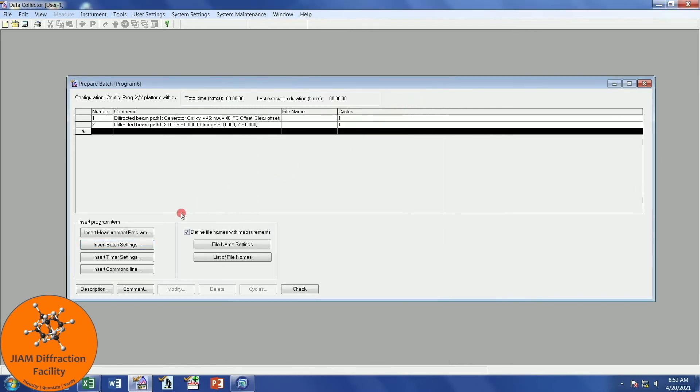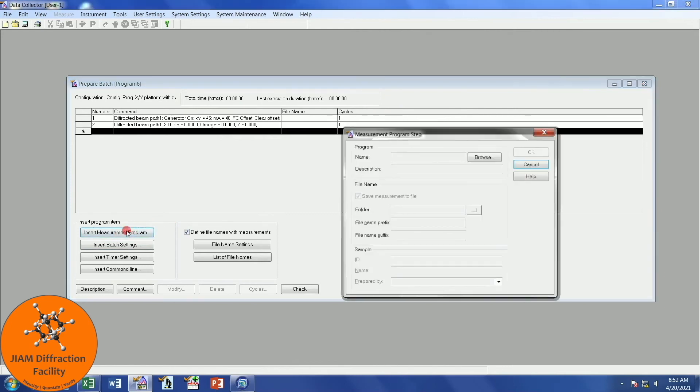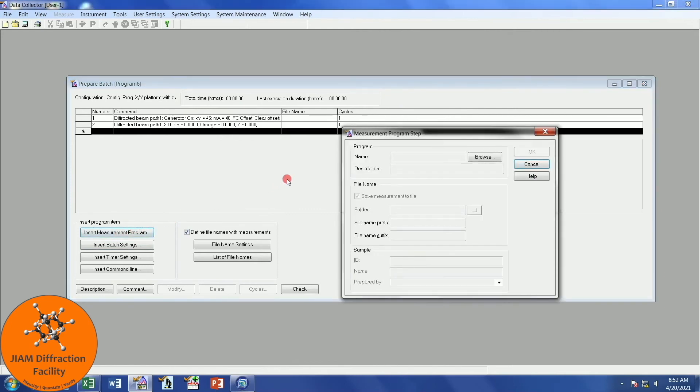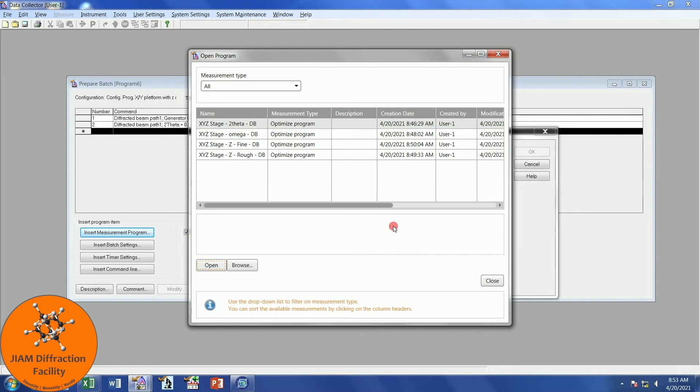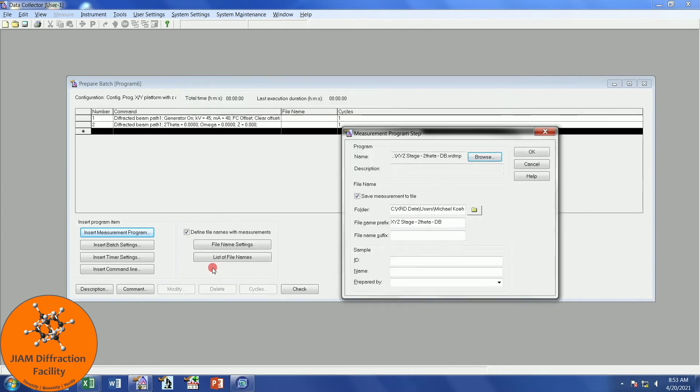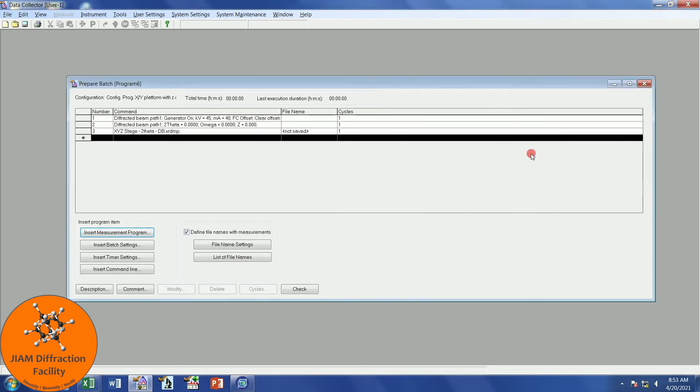We are now ready to begin aligning. So I will enter a measurement program, come over here to Program, Browse. And if you don't see your programs here, you can browse and find them. I have mine here, though, so I will do it that way. We want to start with the 2 theta program, so I will open it. You can save the measurement to file if you want. It's not all that important. I don't usually save it, so I will uncheck it. Click OK. Now we see that appear there.